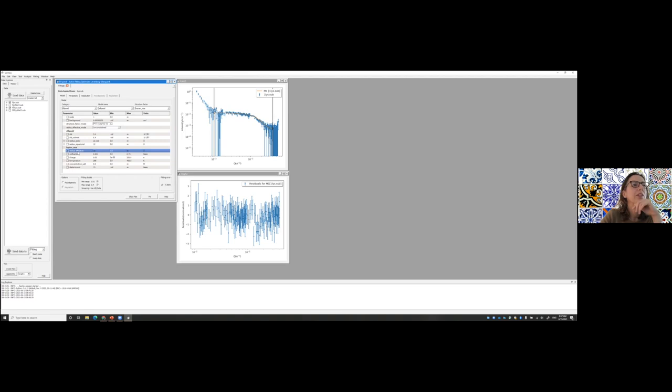We ticked on radius effective. I'm going to click on fit. Okay, we won't see much of a difference because, of course, I was telling you approximate parameters already, but it's done its fit. The chi-square is still pretty low. If you cannot read it, it now reads 0.65. It's pretty good. I could do things like try and fit the background, try and refit the equatorial and polar radius. So you could adjust this further and further and look at the effects.